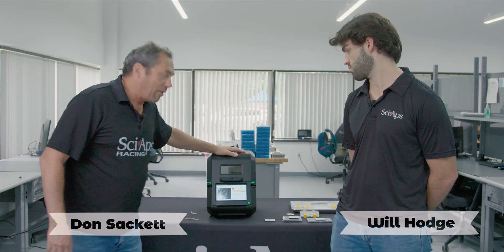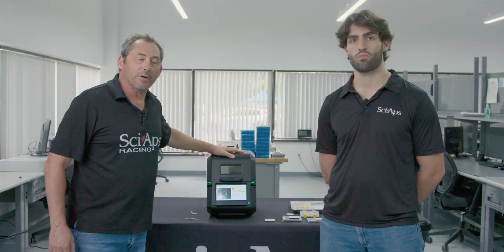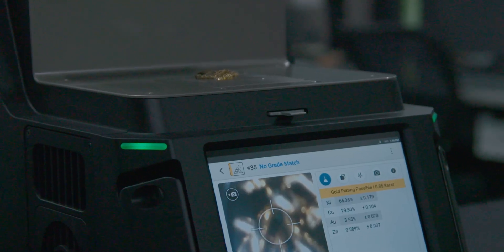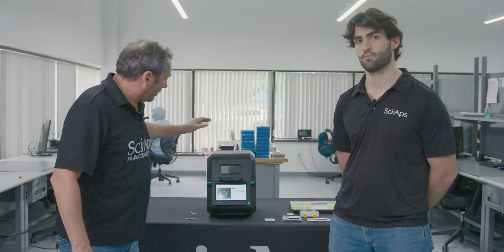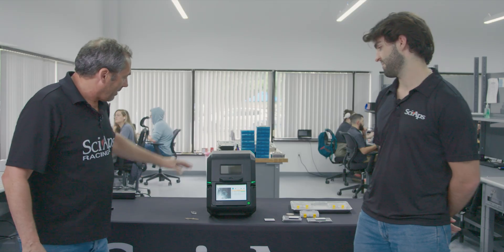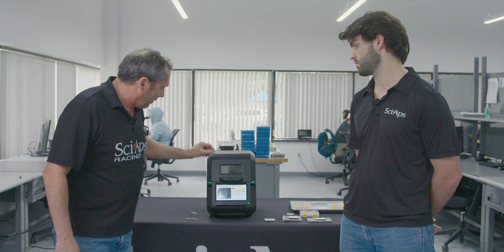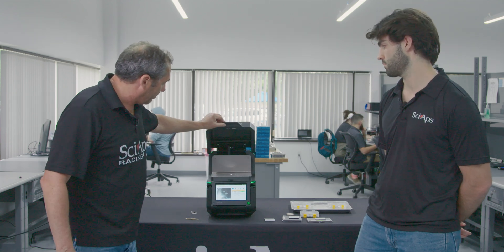Will's the guy that took our powerhouse unit that was originally designed for rare earth metals, and he re-engineered it to be a precious metal system, and we're going to get into that right now. This great new benchtop unit brings a number of new features to the market. First of all, it has a nice big chamber to test materials.